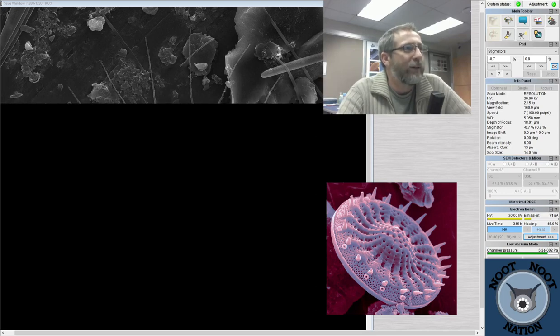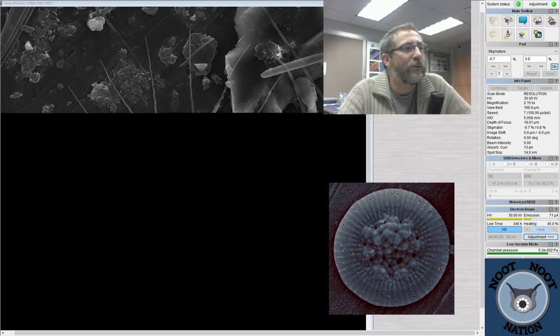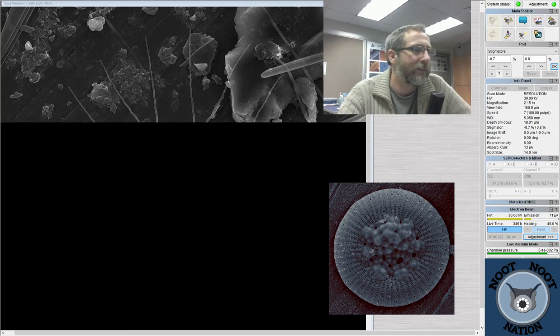Have I found any of the party dudes? Oh, Mama Bon Bon, these samples were treated with nitric acid, which means that all the dinoflagellates are probably dissolved.